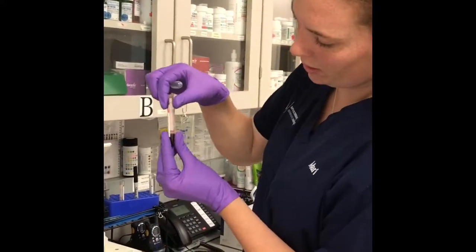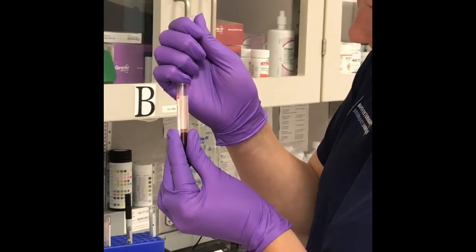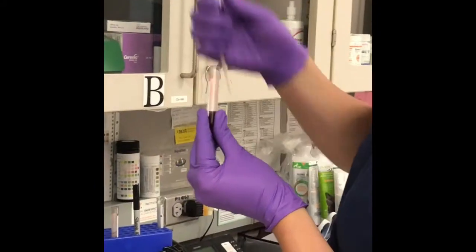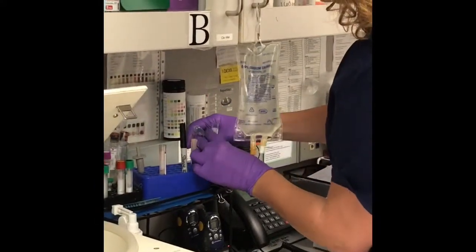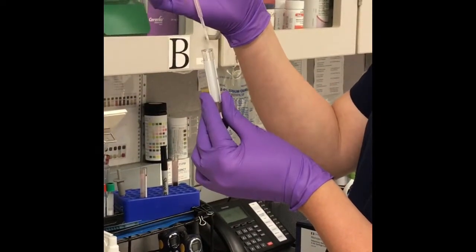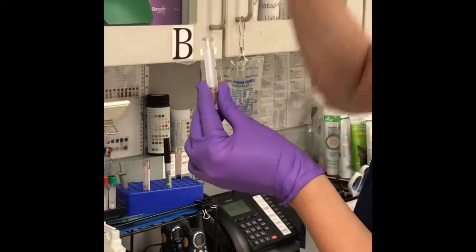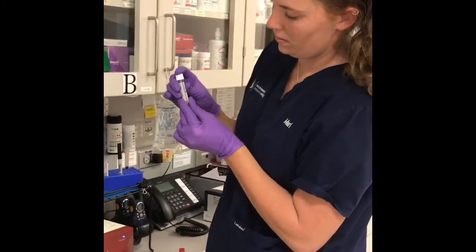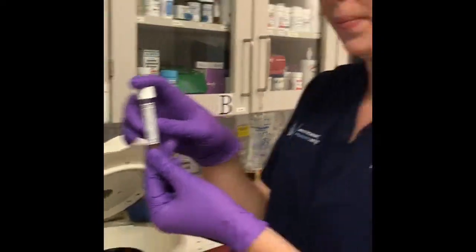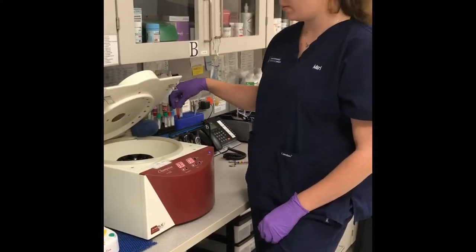This one, it is important to be very careful not to suck up any of the clot itself. You just want to get the serum. Okay, and I am going to go ahead and place this in the same tube. It's the same patient and the same blood draw, as well as using the same pipette. Okay, and there we have our harvested serum. We can go ahead and run our blood work or send it out for an outside lab to run for us.